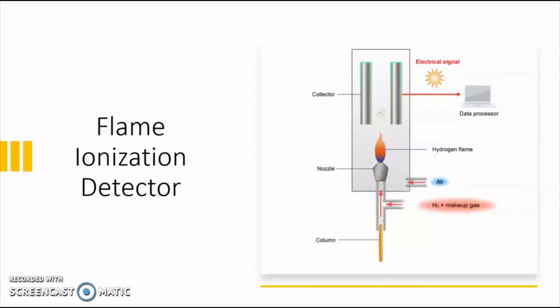The types of gases, their mixtures, and their uses are all method dependent. The FID is used to detect carbon-hydrogen bonds. As the molecules of analytes burn, these bonds will break and produce carbon ions. The collector detects these carbon ions and translates the signal into the peaks that we see on our chromatogram. The concentration of carbon ions produced by the analyte present in our sample is directly proportional to the signal detected by the FID. Let's relate this back to our ethylene glycol testing.